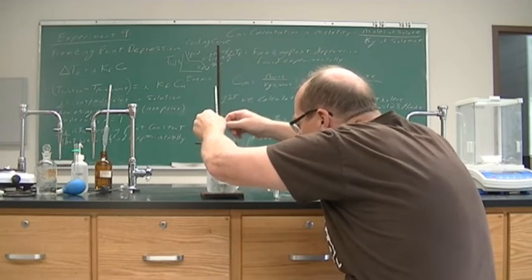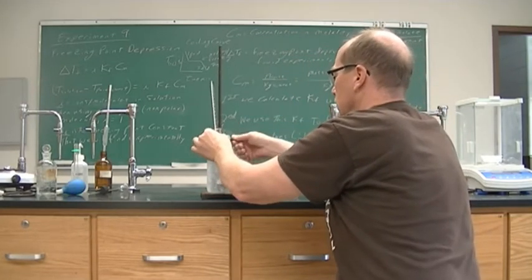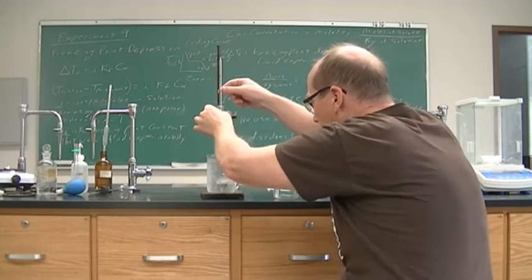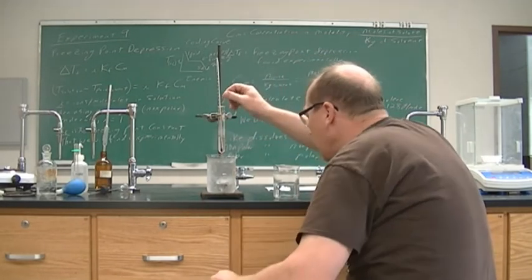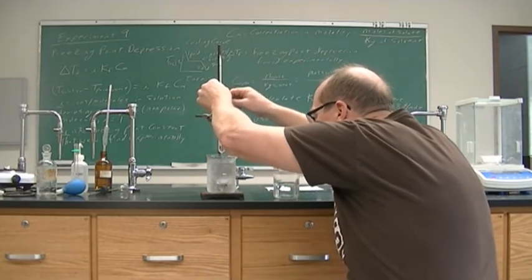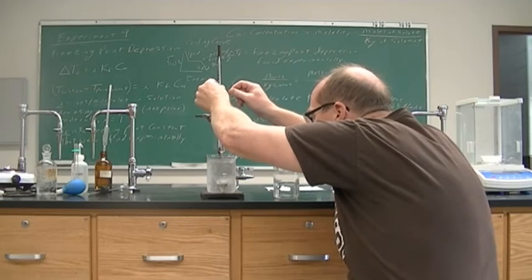Like 2.2 is the temperature. Let's see the solid in here. All right, so now I see the solid. I just couldn't see it before.